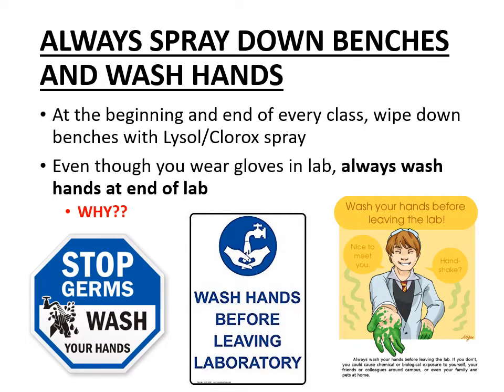We do it at the beginning also because when you walk into these laboratories, you don't know how careful the people who were in there before you were. So it's best to be safe and careful yourself, rather than just relying or assuming, oh yeah, I'm sure the other people, they cleaned it up, I should be fine. Nope, always spray it down yourself before and after.